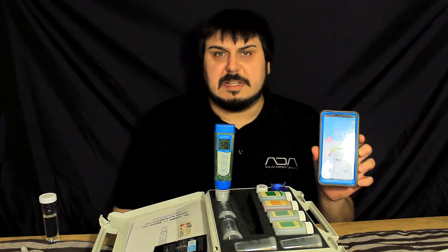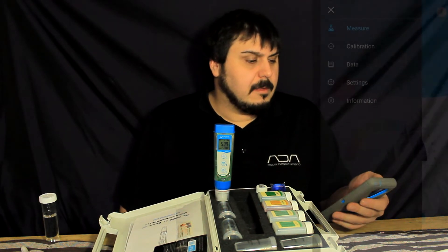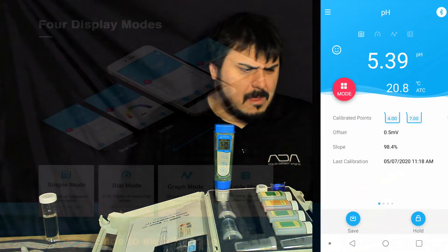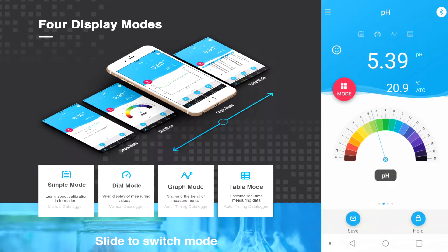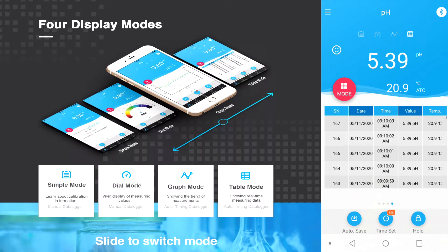Now I'll show you the Zen test app and how it works with the PC60Z. There are different screens you can use. The first is simple mode, which shows your calibrated points, offset, slope, and the last time it was calibrated. Then you can click the mode button to choose from pH, ORP, conductivity, resistivity, TDS, and salinity. The next page is dial mode, which shows a visual dial of your current reading. After that is graph mode, which shows a graph of your previous test readings. And the last one is table mode.